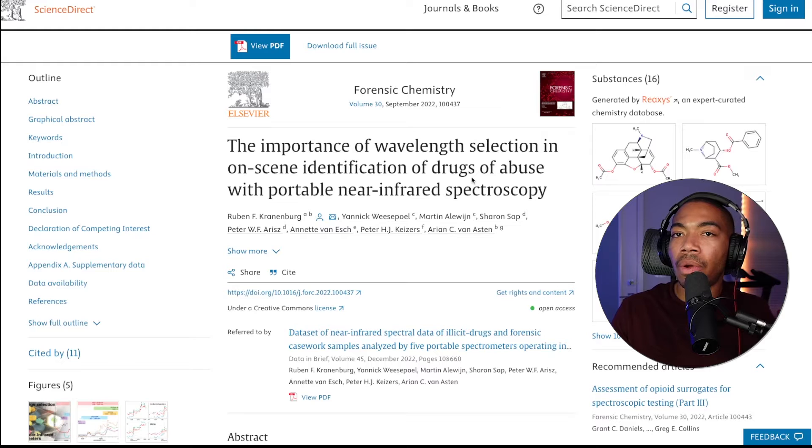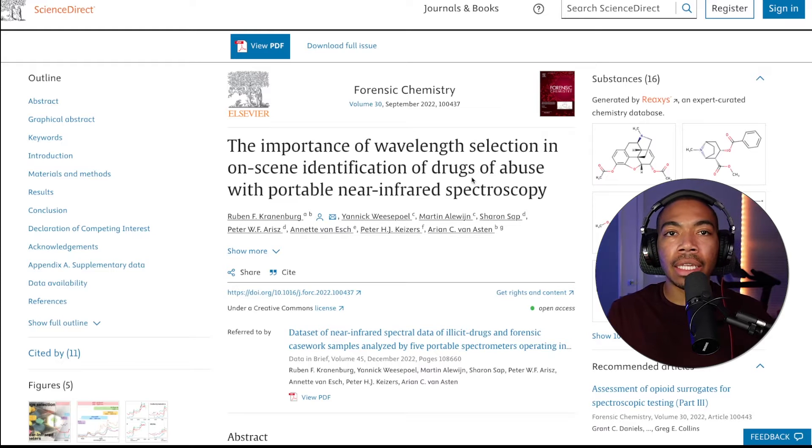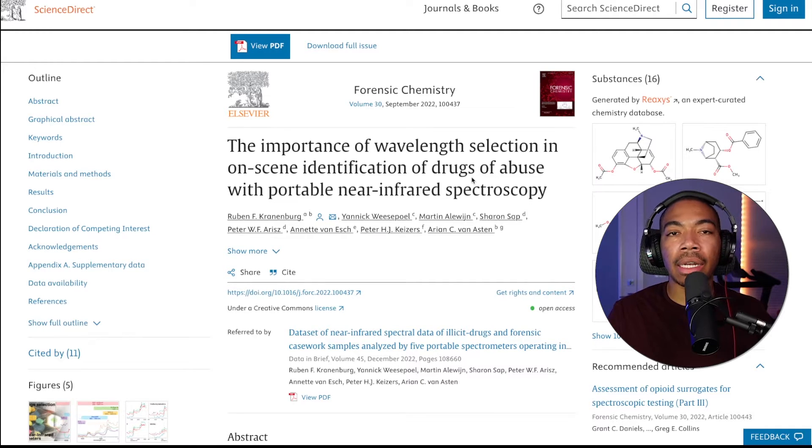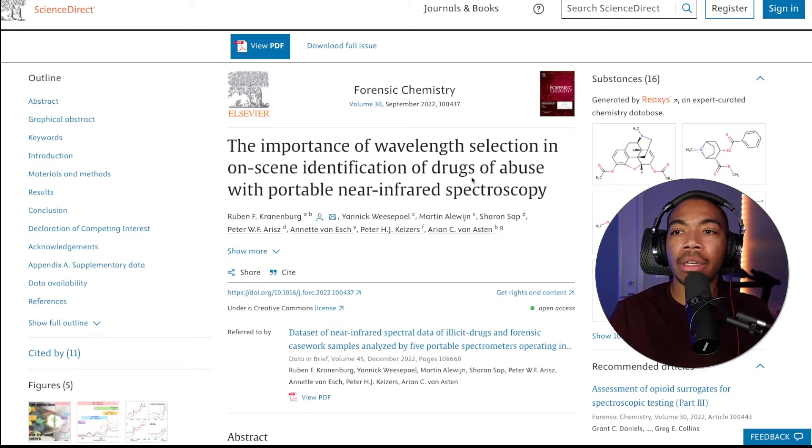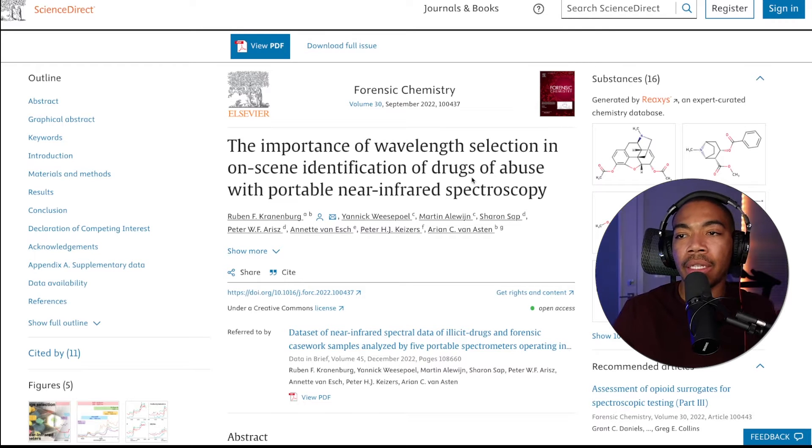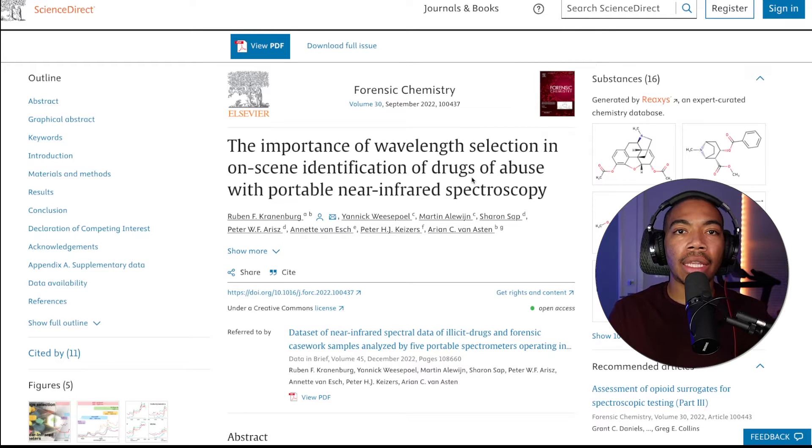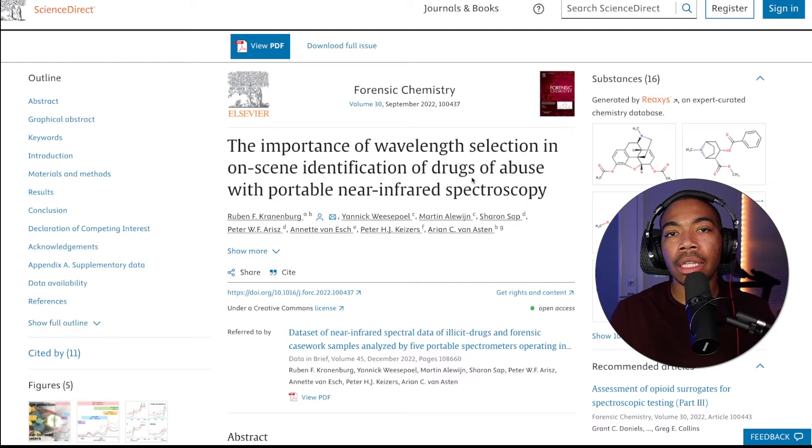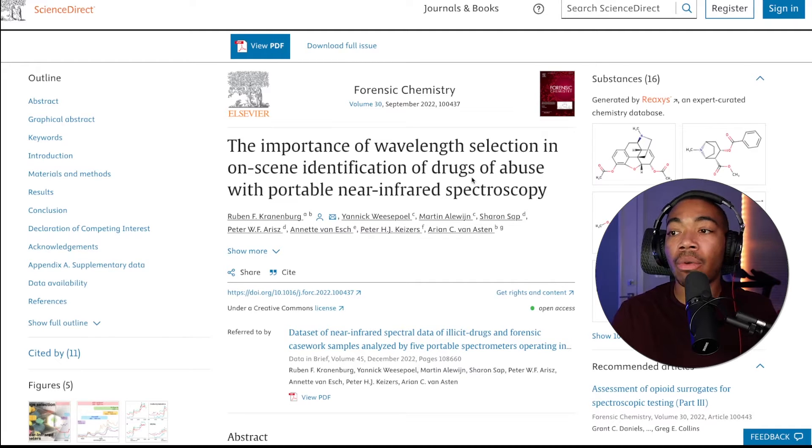So all the data in this series will likely come from this paper in which we're going to be analyzing cocaine, heroin, methamphetamine, we're going to look at the adulterants, but we're also going to look to make sure that the data we're going to use in those models is of high quality.